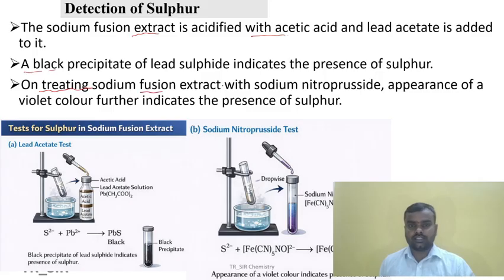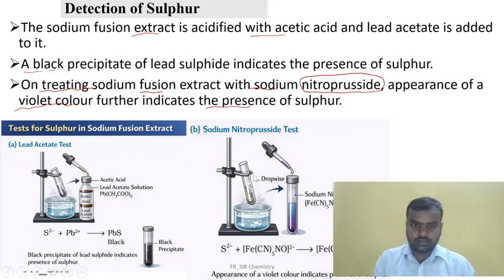And treating the sodium fusion extract with sodium nitroprusside, the appearance of violet color further indicates the presence of sulfur. Wait, we'll try to understand this particular case.